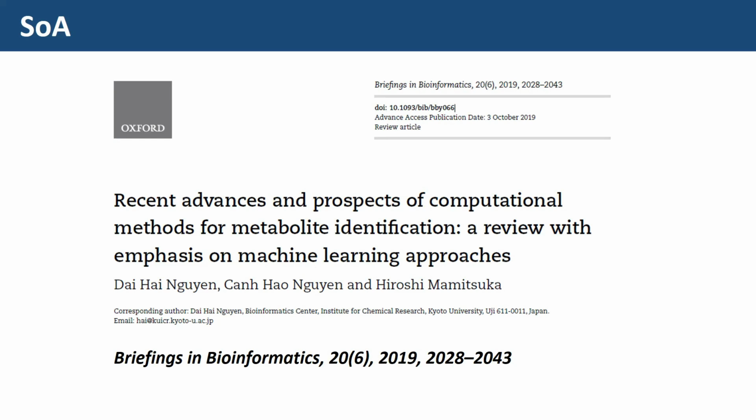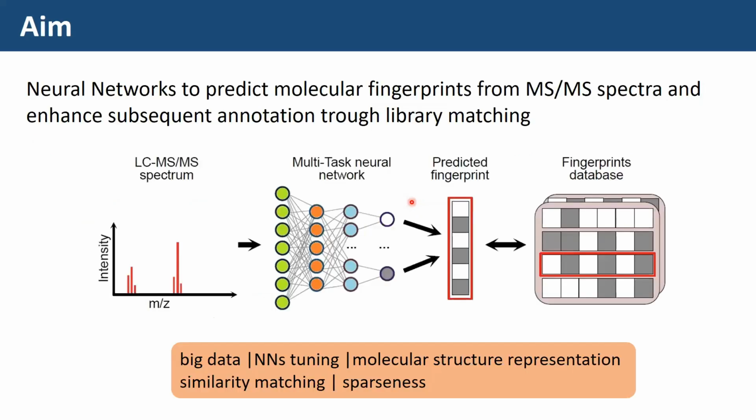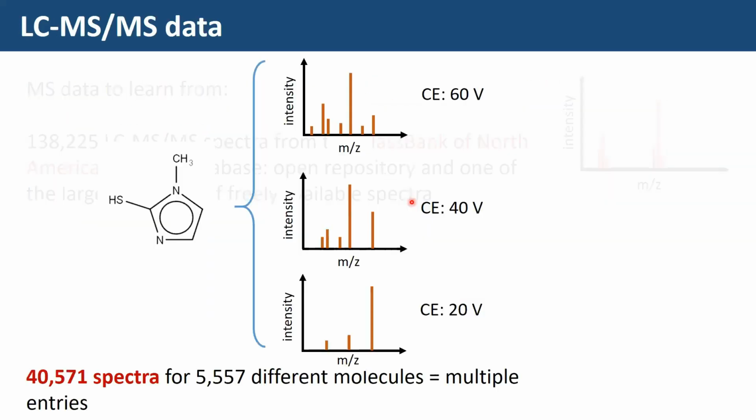Yeah, but then you have a lot of data sets, which have very reduced size. To have the collision energy as a predictor, yeah, but it's just one feature.